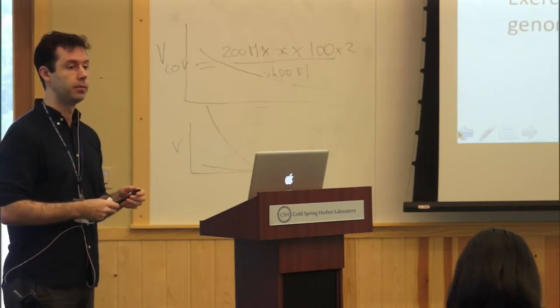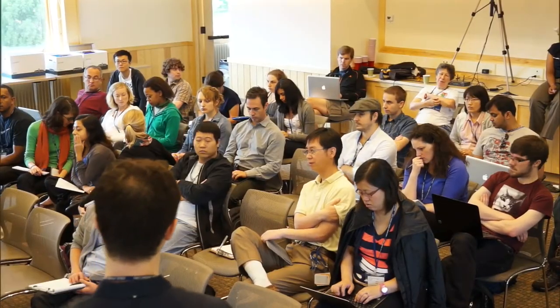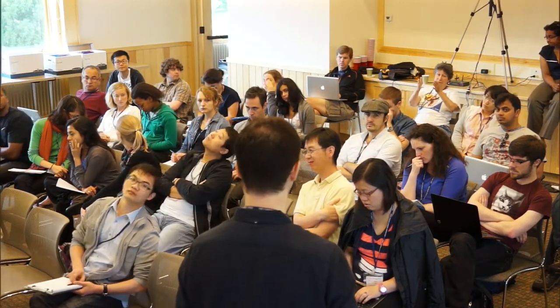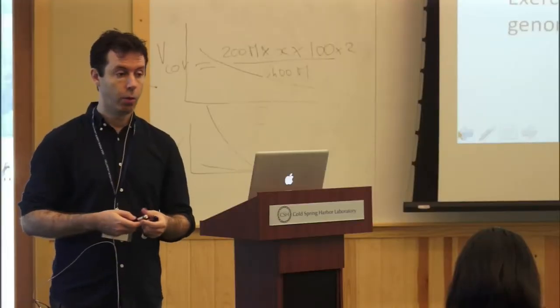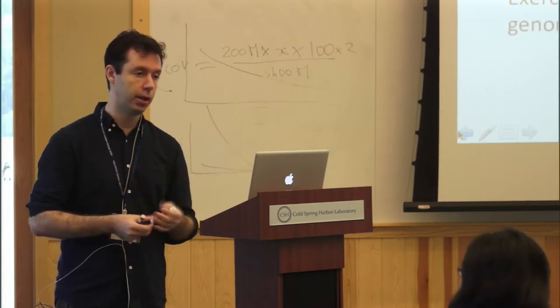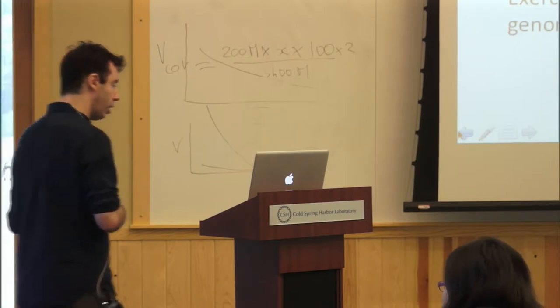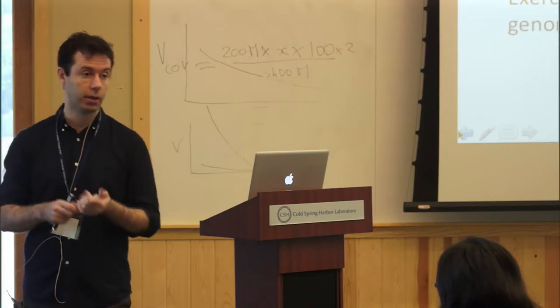So when you see pictures of tracks of mapped reads, they don't look very uniform. So how uniform is coverage these days for genomics? Right, this is a very good question. For example, in my lab we do a lot of whole genome sequencing and exome sequencing. Frequently people ask, well, what's your coverage? What's your average coverage in exome sequencing?